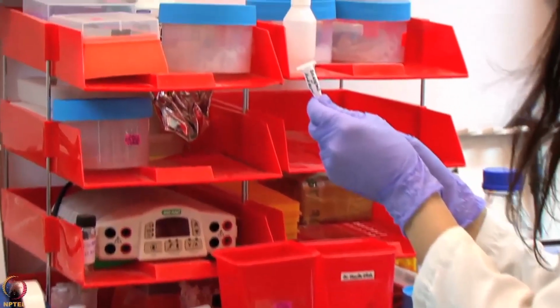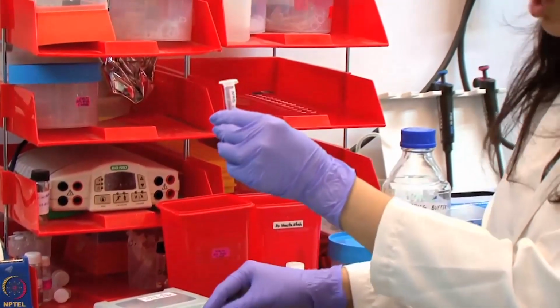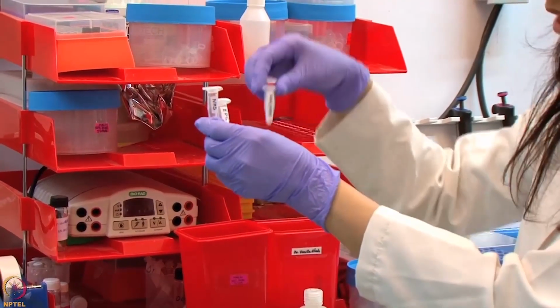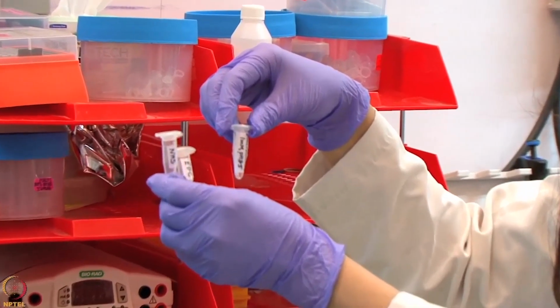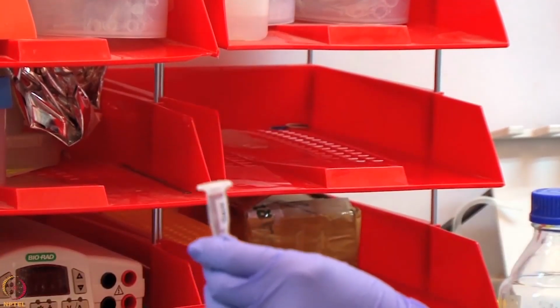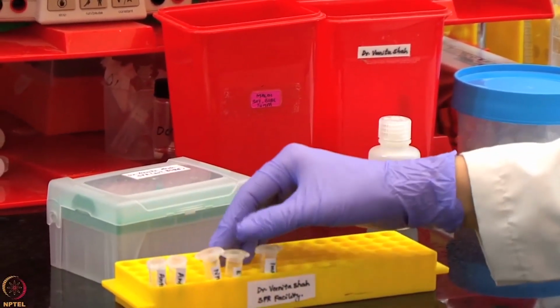This is our 30 microgram per ml of ligand solution. Aliquots of NHS, EDC and ethanolamine are prepared and transferred to the specialized tubes used for the system.